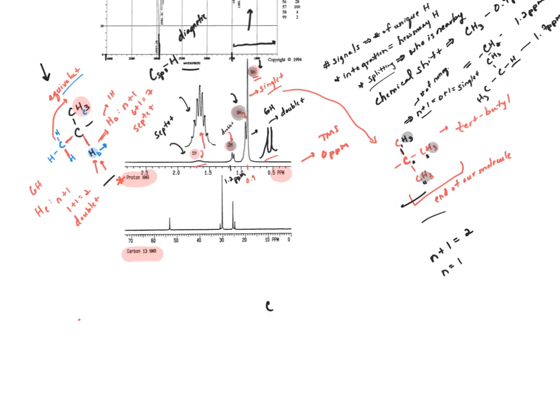CH3, CH3. Let's move this. It's getting very mad at me. Okay, so we have this one. We have our tert-butyl, and then we have our isopropyl.